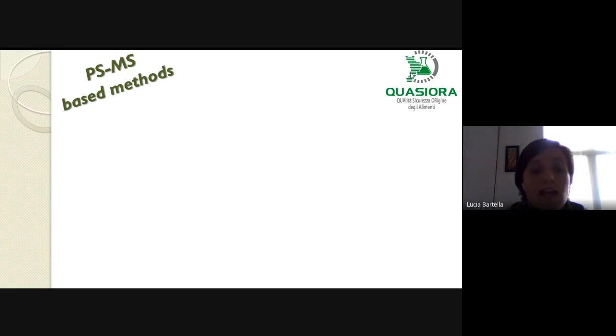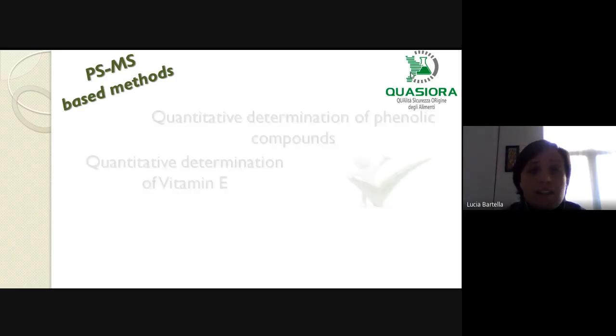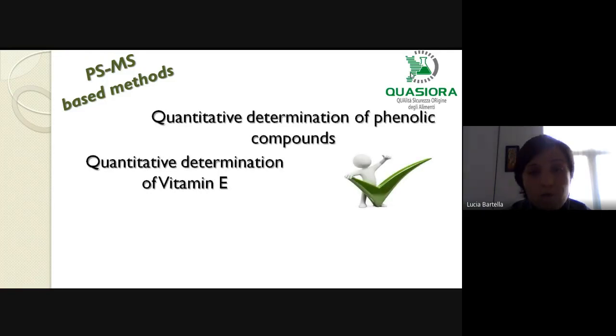But today I'm going to present our latest work, the quantitative determination of phenolic compounds and of vitamin E in extra virgin olive oil.